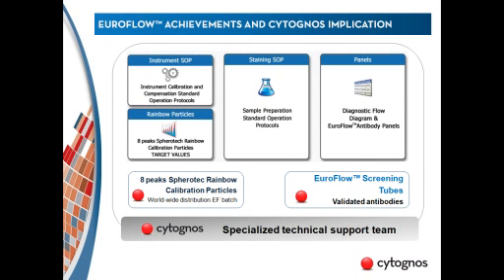Also, they released the sample preparation standard operating protocols just to make sure that everyone stains the samples with the same incubation time, same lysis time, so everything is standardized. And the most important, the antibody panels. A lot of antibody panels for different diseases: acute leukemias, chronic lymphomas, B, T, NK, myeloid, so different panels for different diseases.